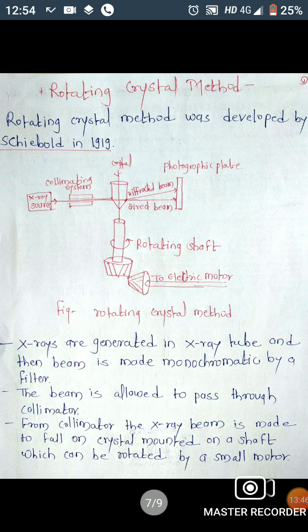Now we see the third method, the rotating crystal method.